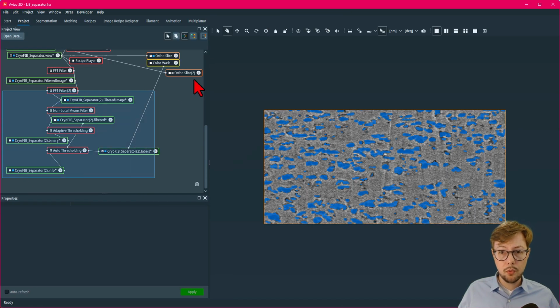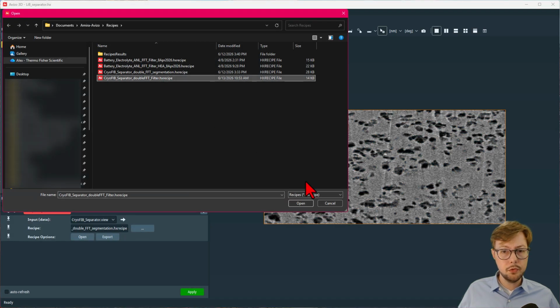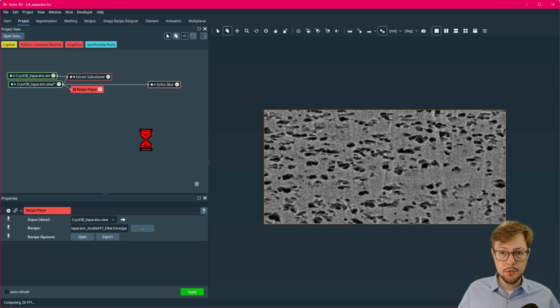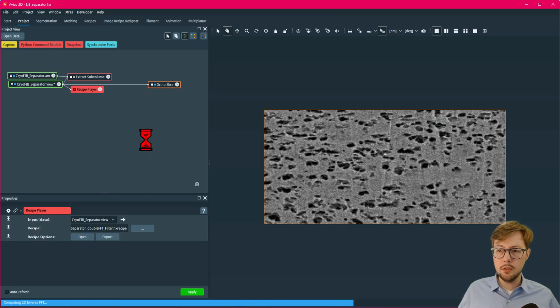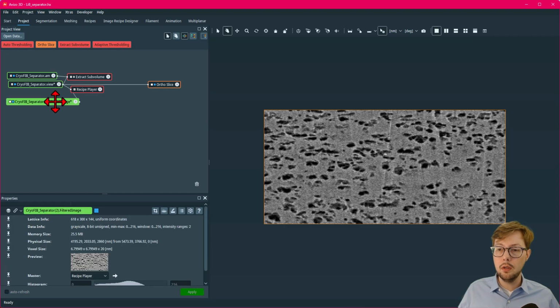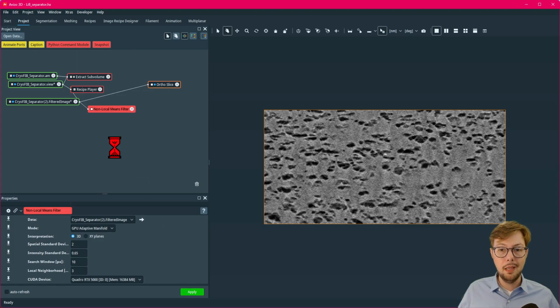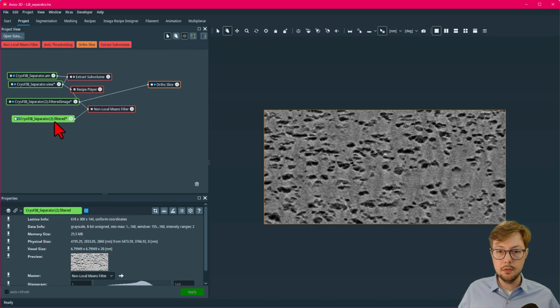Back in the project workroom, I will remove some prior work and then load and apply the filtering recipe. As you see, the two filtering steps are compressed into one recipe player step. I can then continue to do work and make a comprehensive recipe that uses the filtering recipe as a step. So this means that there are nested recipes.